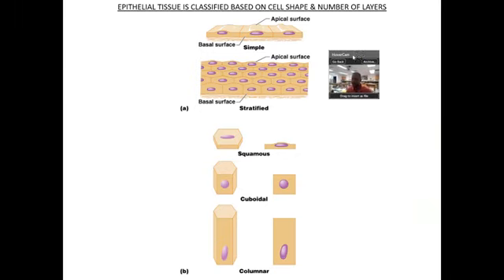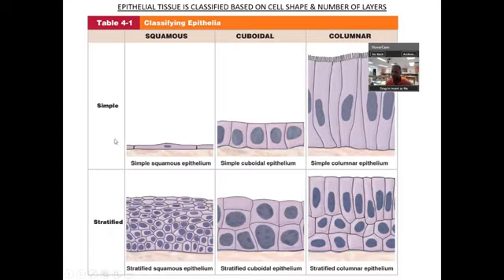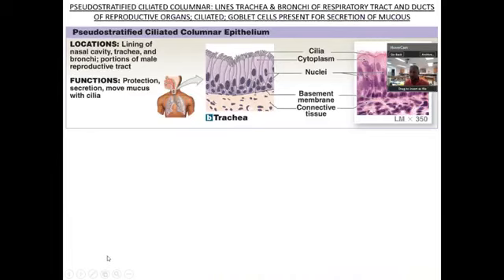epithelial. First is one of your 4 types of body tissues for histology, and one of the things you want to focus on is the shape of the cells and the layers of the cells. I'm not going to go over this in great detail because I've made other videos you can watch. So remember, you've got shapes and then you've got layers. If you want to go through this or pause this video, if you're one of my students, you should have access to this material.